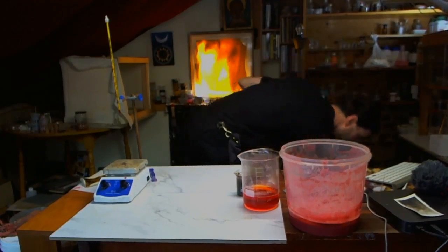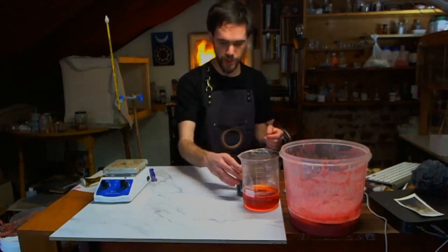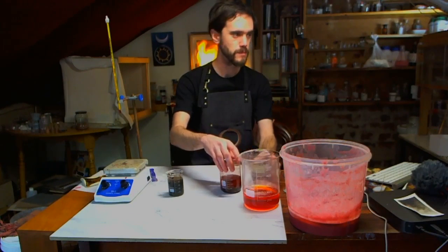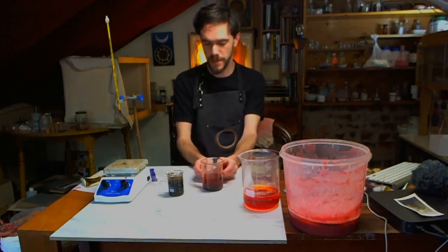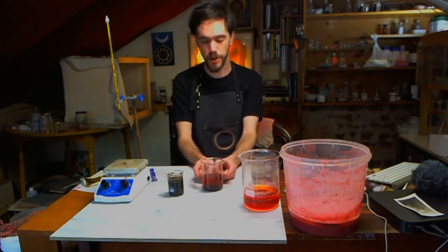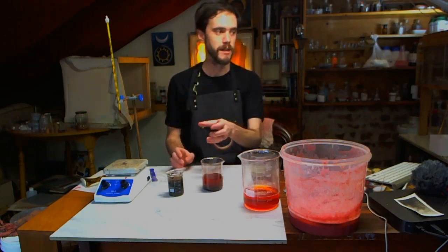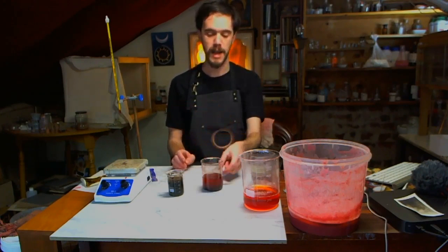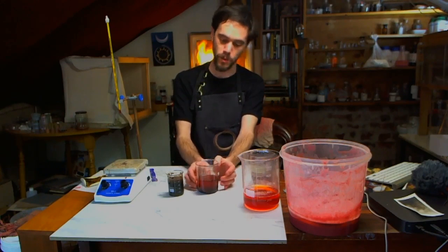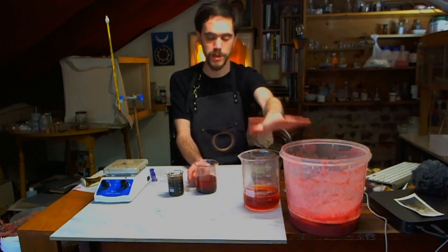All right. So let's also review a few of the other things we were doing yesterday. In this beaker here, this was the one that was originally the sulfuric, no, this was the hydrochloric acid soak that I did. Remember the small 10 grams that I had yesterday where I let that sit overnight in the hydrochloric acid, and then we washed the acid out, and then we put it into an alum solution, so the potassium aluminium sulfate. And so what we'll do today is we'll try and extract the color from this to see if there's any difference in that method compared to the other method we did.